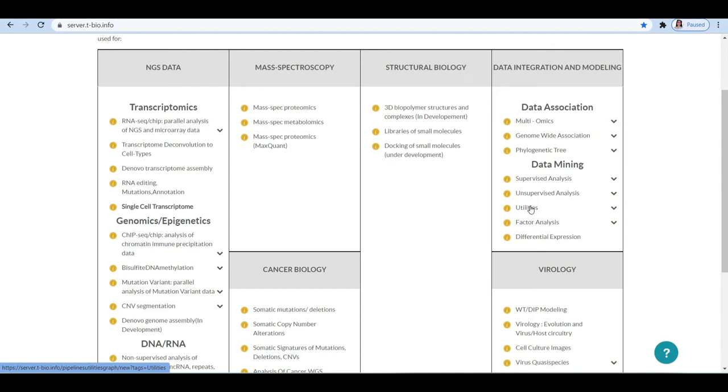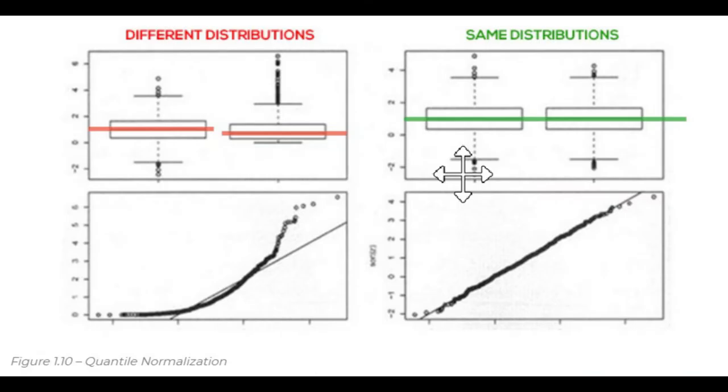Hello, today we are going to talk about normalizing the table of expression. RNA-seq data has been shown to have skewed distributions, unequal variances, and extreme values. Most statistical tests, including ones that we use in our analysis, have an assumption of normality. The three aforementioned issues violate these assumptions. There are a number of normalization approaches that may be used.